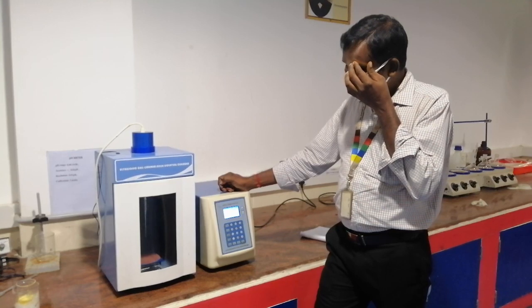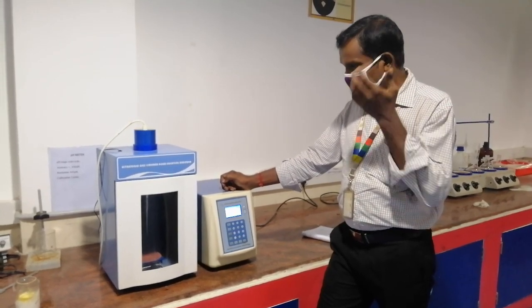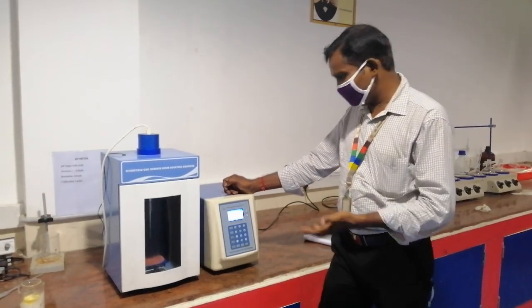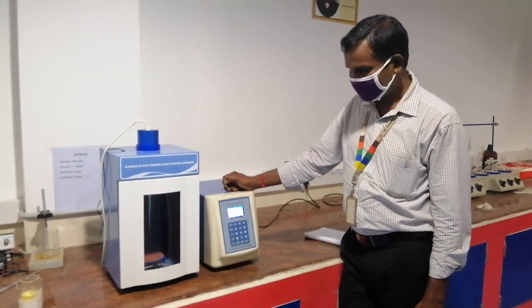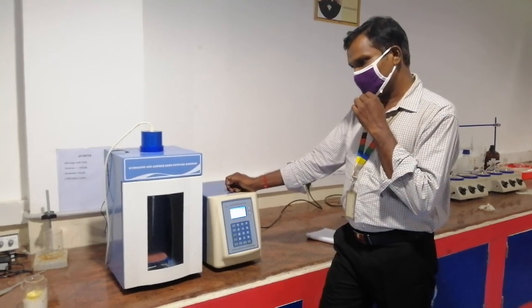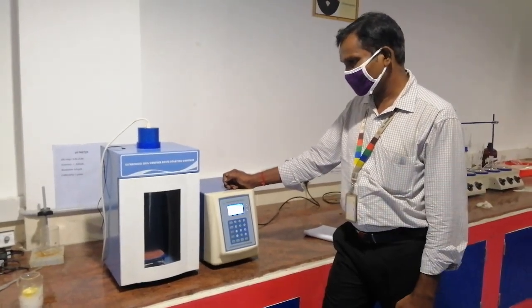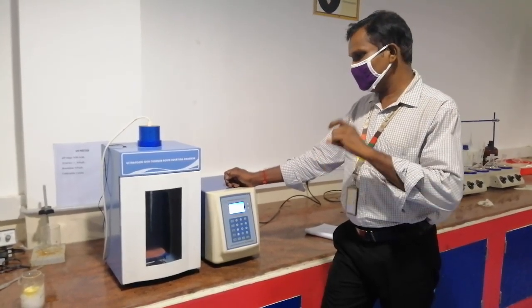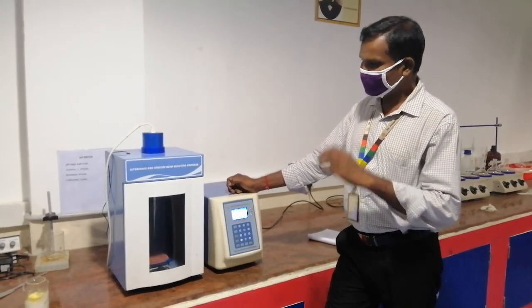So after the first cycle of 30 seconds of cell destruction, you have to collect the sample for protein estimation. And then disrupt the same cell slurry again for the second cycle. In the second cycle also, you take another 30 seconds. So total time is 60 seconds. The cycle time is 30 seconds, so after each 30 seconds, you have to take a sample. The first cycle time is 0 to 30 seconds.